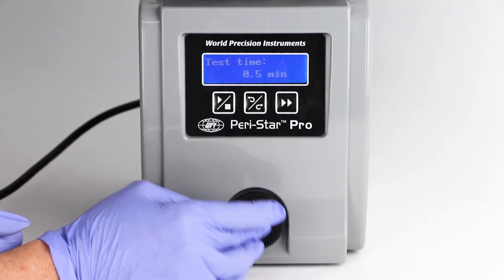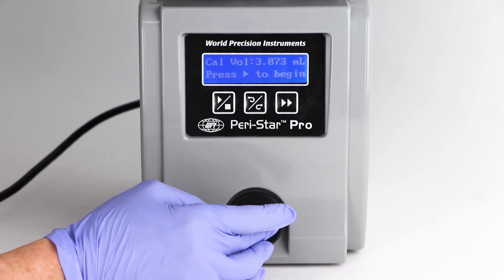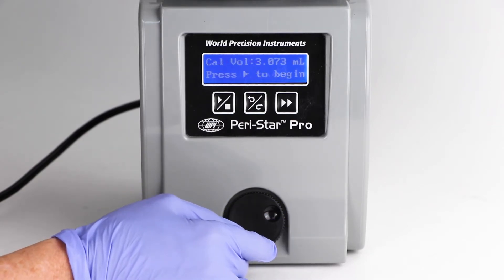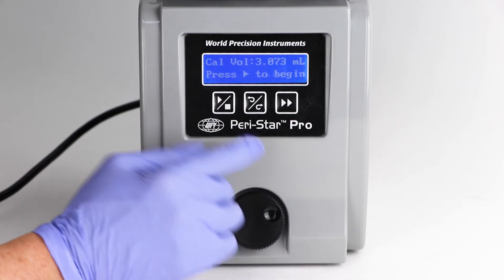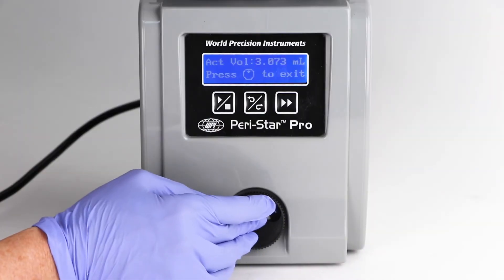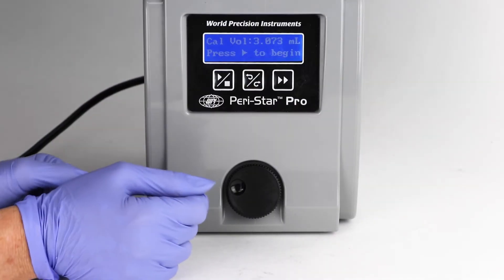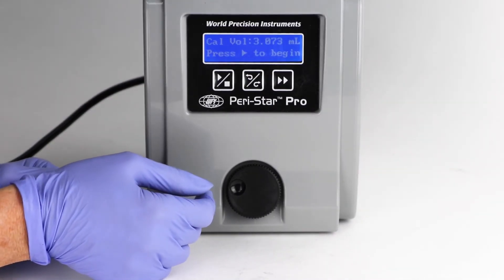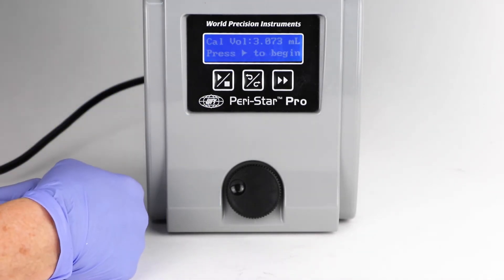When the main menu displays calibration, click the control knob. The screen briefly displays the test time and then automatically switches to the sub-menu, where you can choose between cal volume (calibration volume) or act vol (actual volume). Calibration volume is the first sub-menu item and it shows the solution volume to be pumped.